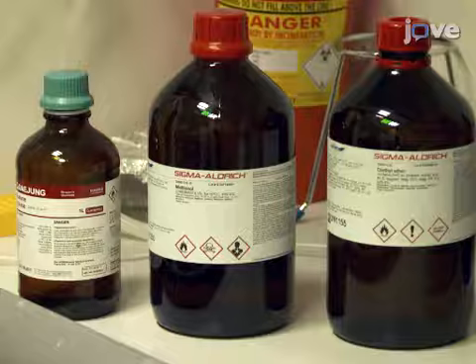Always add nitrogen or argon before freezing the pigments for storage, and ensure that all solvents are analytical grade.